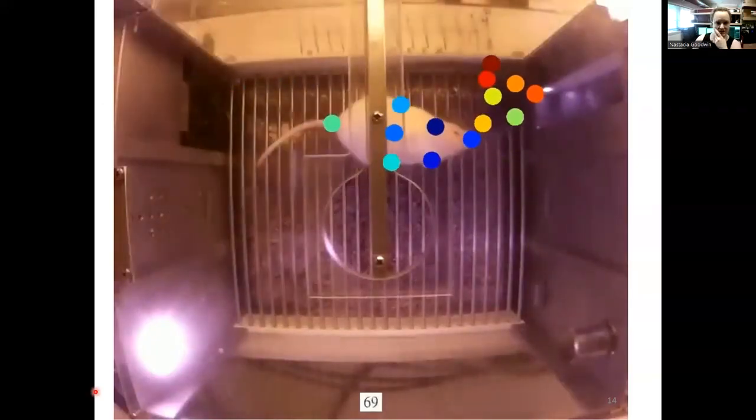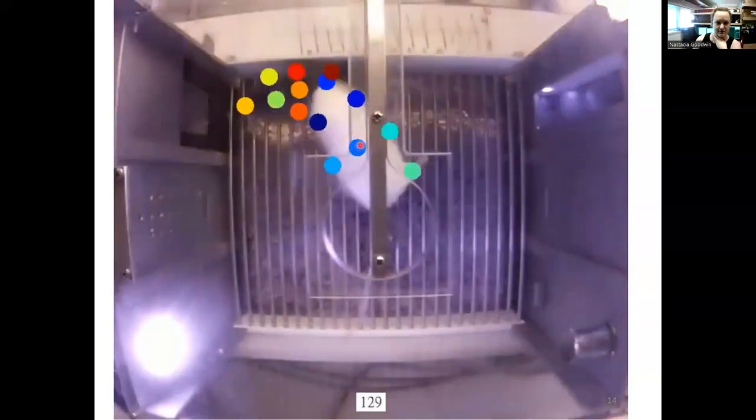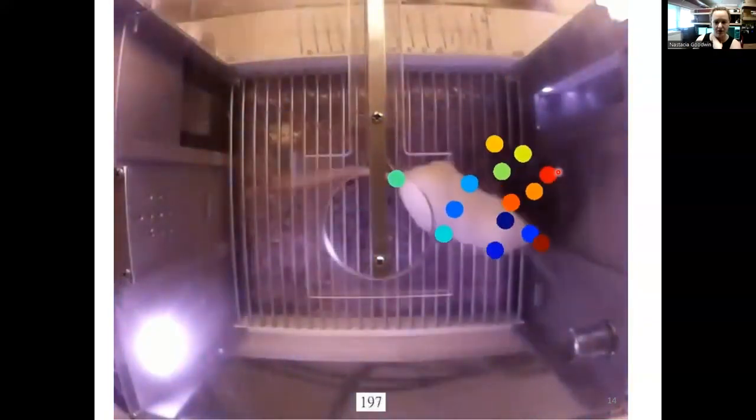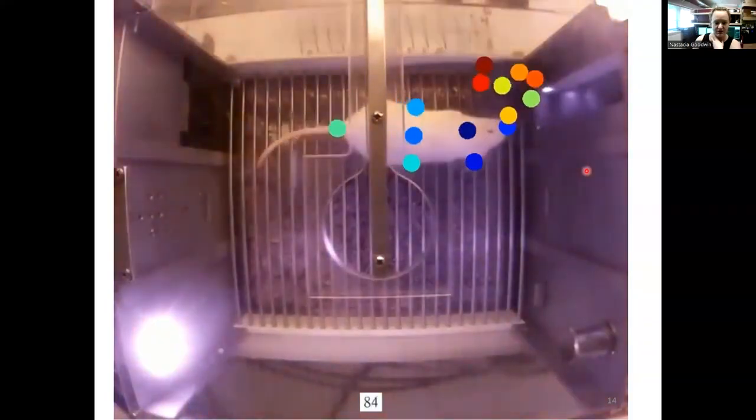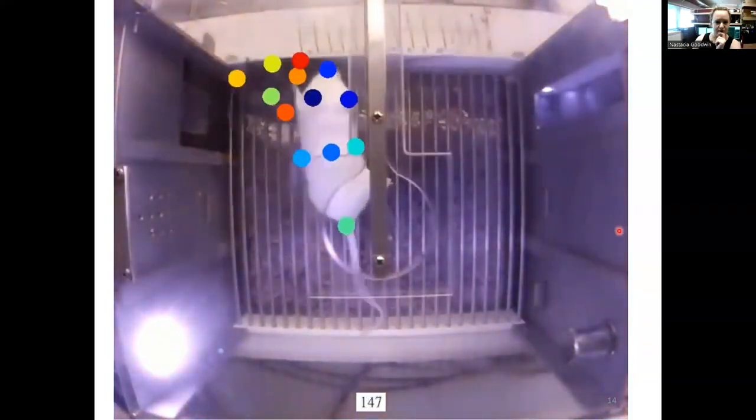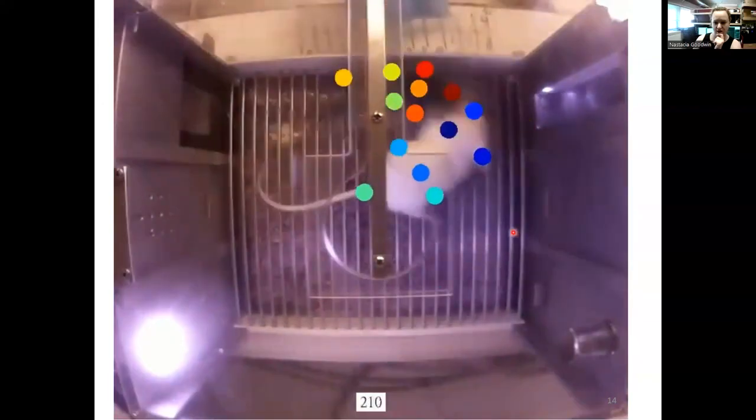Okay. And so we can see that they're pretty stable. We can see that there was a jump when the animal walked under the bar. Also, I like this color scheme because I think they look like little clowns. But for the most part, everything is staying where it should be, and there's minimal jitter.